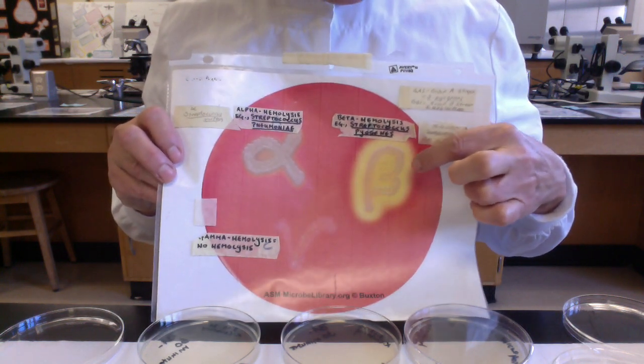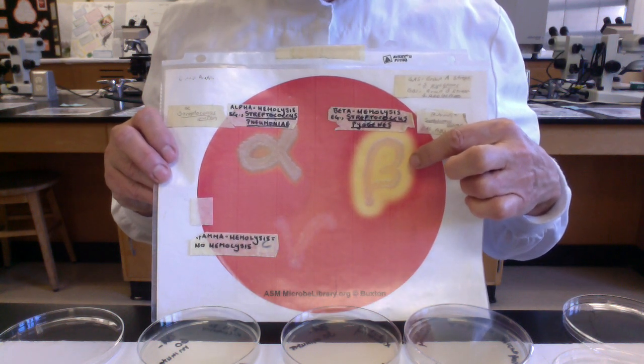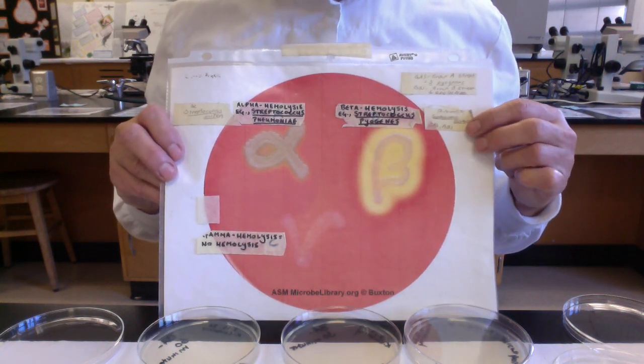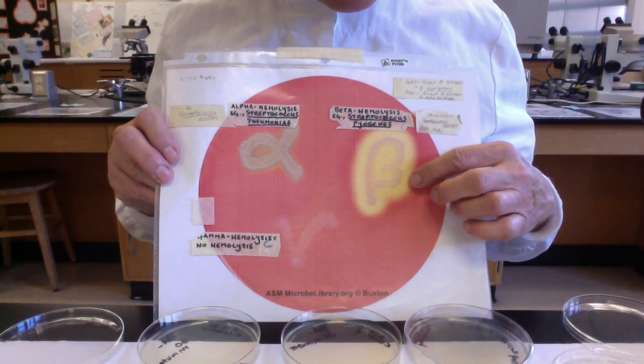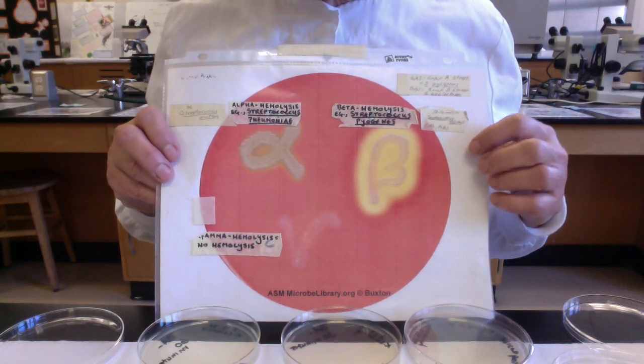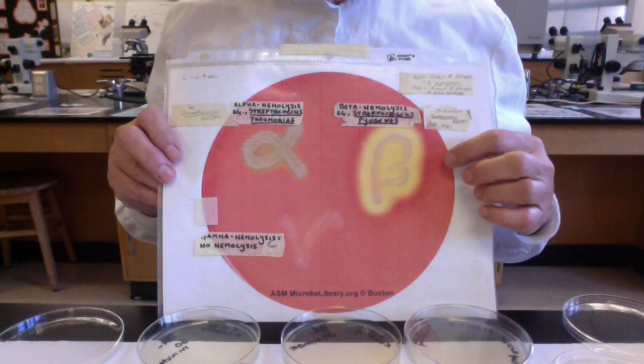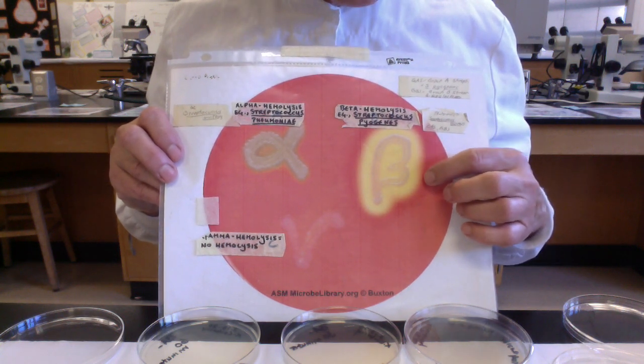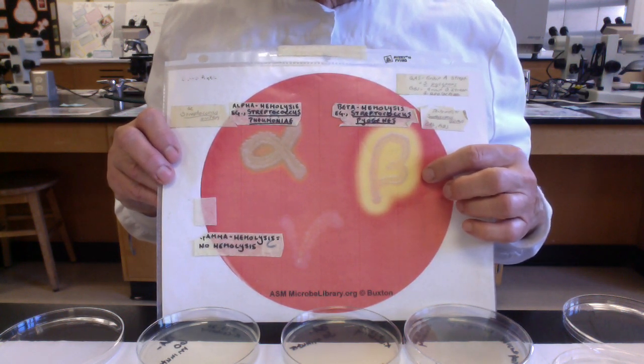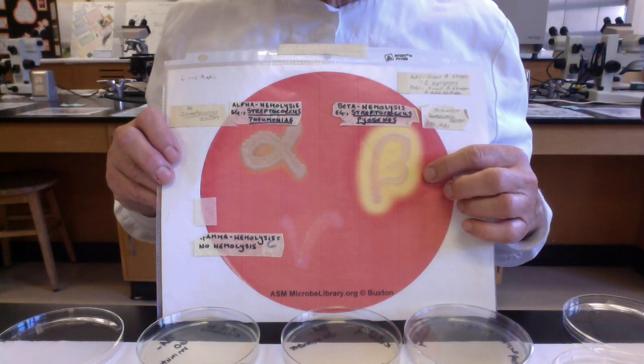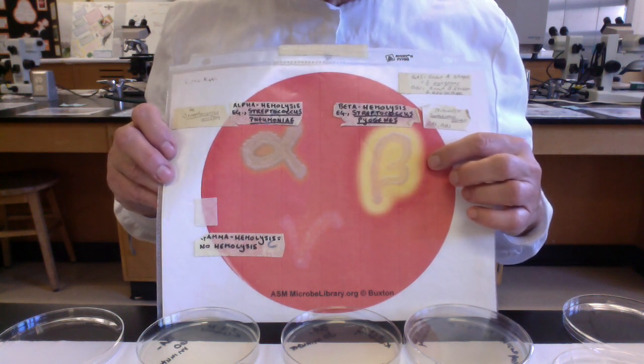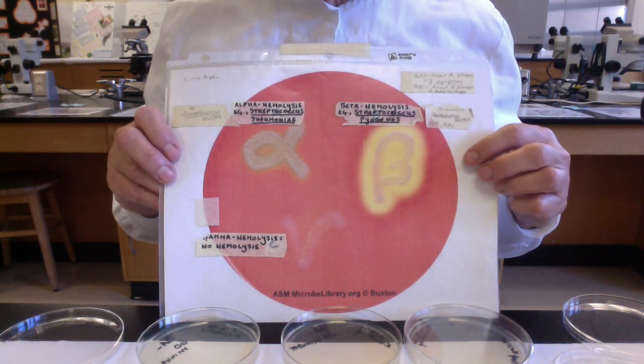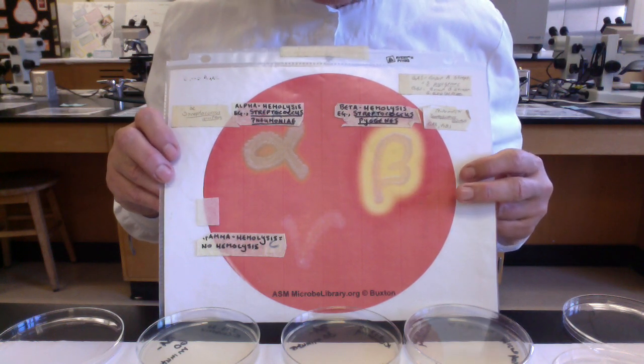This one, it's a little bit hard to interpret this, folks. This is called beta hemolysis, and if this was an actual plate we would see that the blood agar is totally transparent. It's like glass. We could hold the plate up to the light and light would just come streaming through. If we held the zone of beta hemolysis over print, we could read through it. So this is beta hemolysis, complete and total destruction of the red blood cells and their contents.